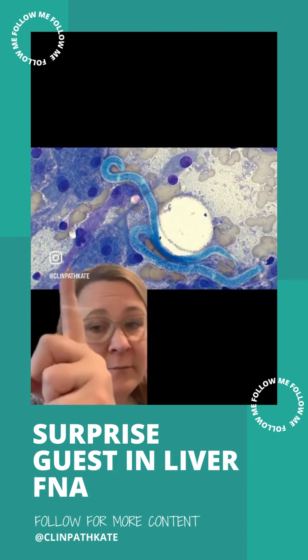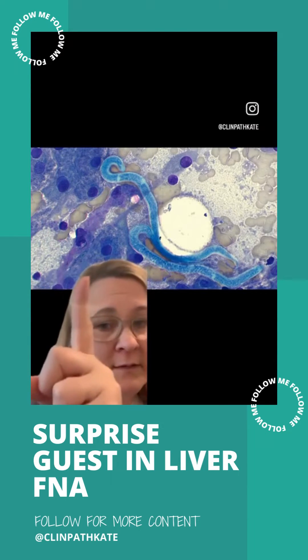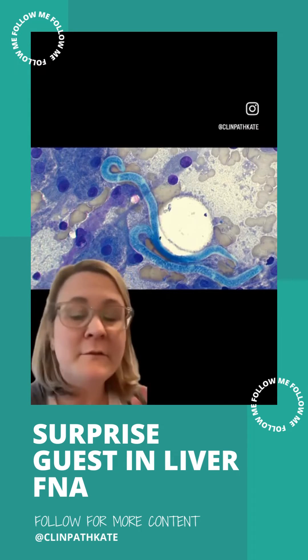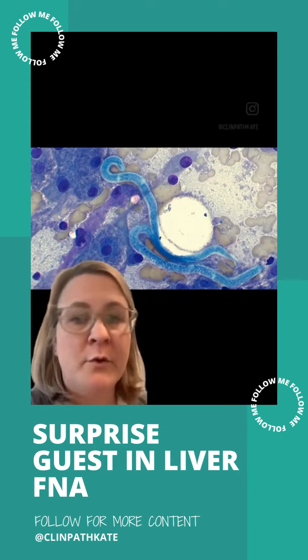We've got lots of hepatocytes here — these little cells that are kind of stuck in clusters, have that blue foamy little cytoplasm. Those are beautiful little hepatocytes, totally normal, nothing wrong with them.